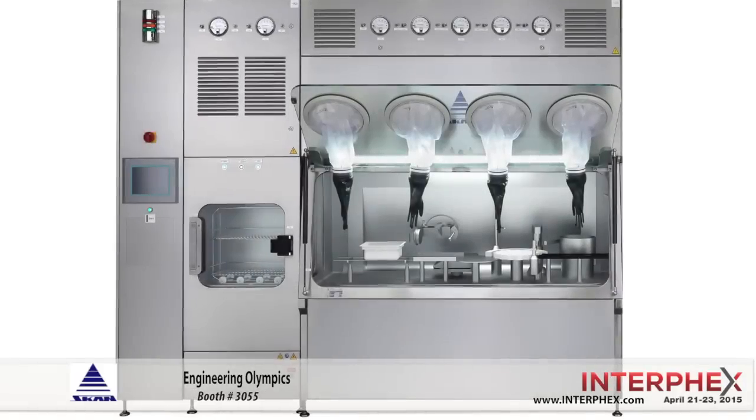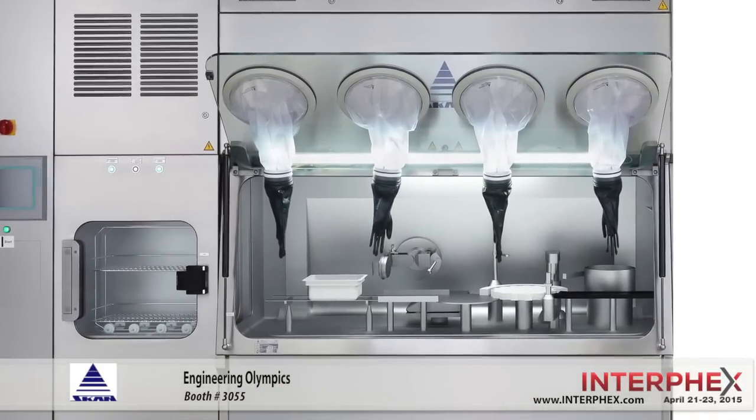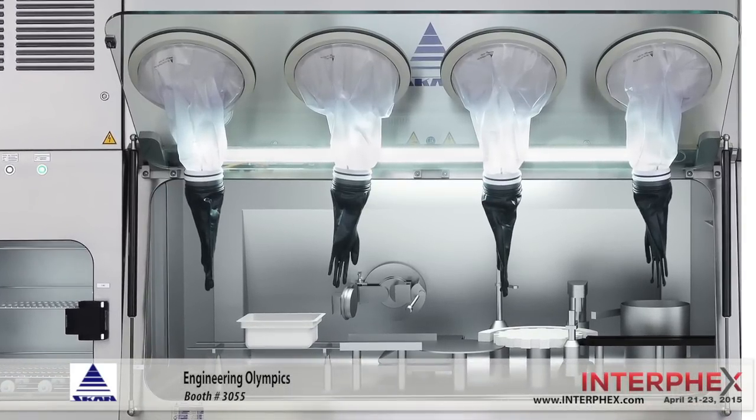This is the first year we are going to hold the Engineering Olympics for SKAN. This is going to be a lot of fun where everybody is going to get a chance to try out their skills working through glove ports in an isolator system. We are going to have one of our PSI, or pharmaceutical safety isolators, right here in our booth, and there is going to be a competition where you can put your hands in the glove ports and try to perform certain tasks through those glove ports and try to do it in the fastest time.